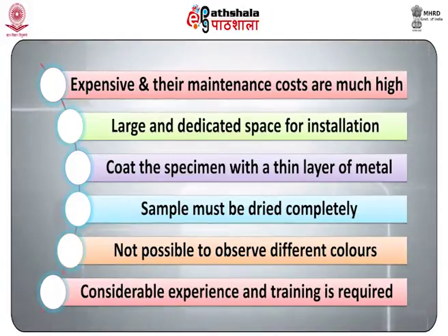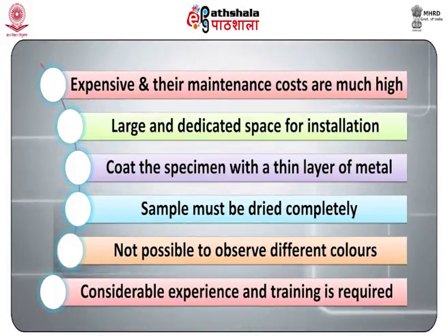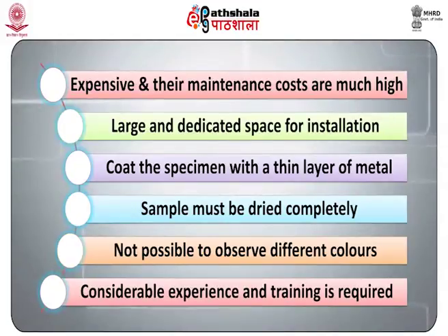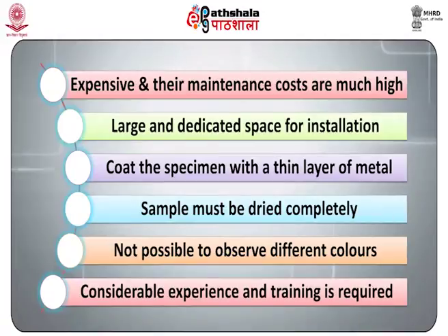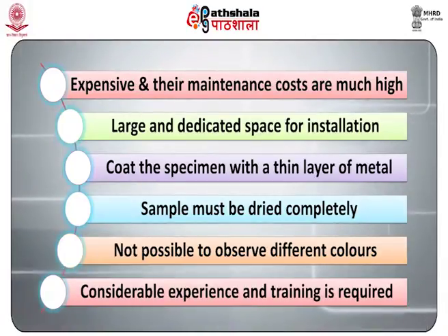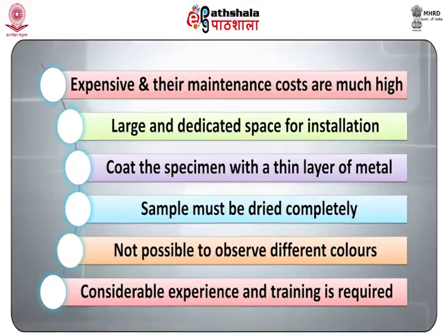Then the system requires a large and dedicated space for installation. Sample preparation is often much more elaborate, since it is often necessary to coat the specimen with a thin layer of metal such as gold to reflect the electrons. Another significant disadvantage is that the sample must be dried completely and living specimens cannot be observed.